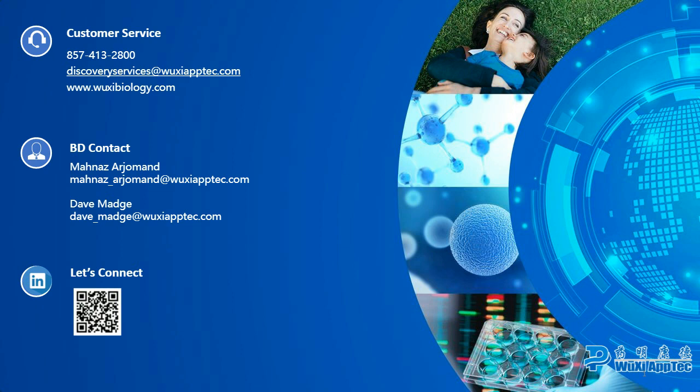Supposedly the control library should be equally distributed in the DNA sequence. If we see anything being an outlier, that probably indicates a false hit, probably coming from DNA tag binding. Then we remove it from the downstream analysis. So that's how we avoid the false hits. And we also do special treatment to the library. Thank you.